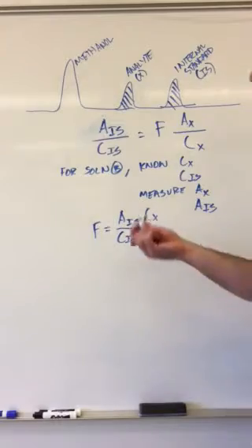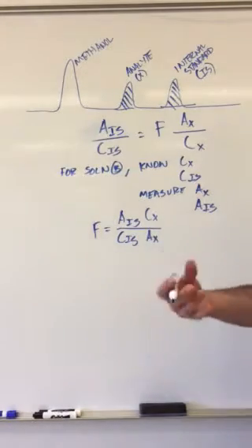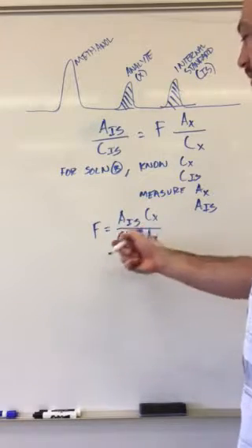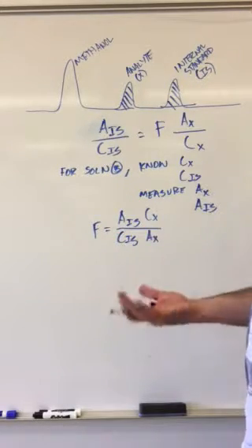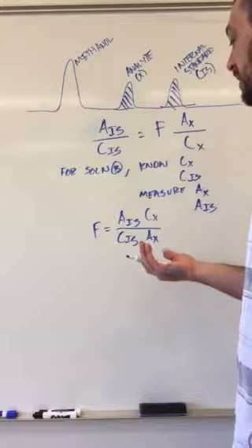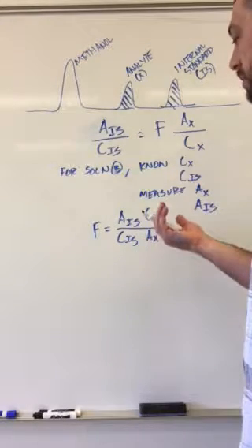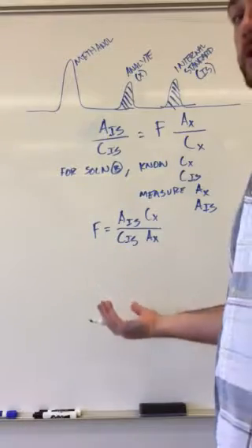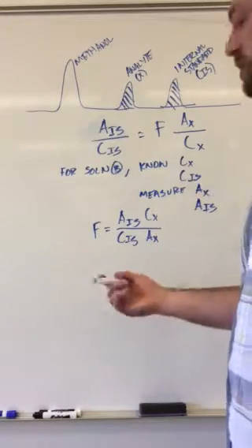And the reason that we're using this internal standard method, or one of the reasons, is to demonstrate how the internal standard can be used to correct for issues of imprecision. For example, one obvious area of imprecision is the manual injection.